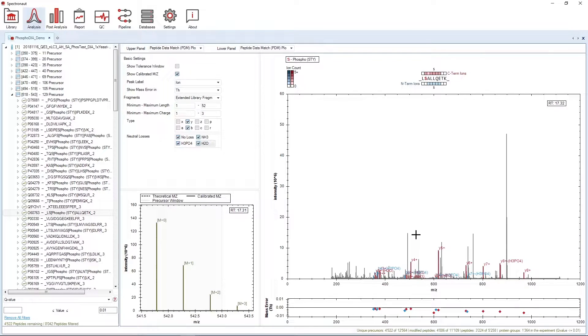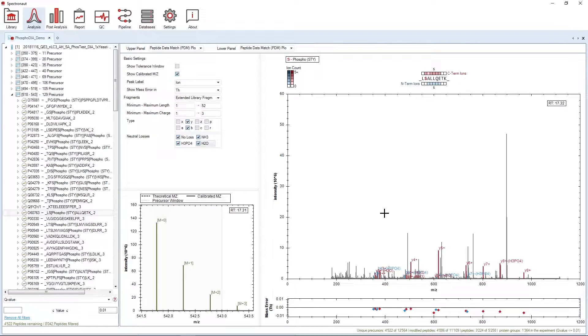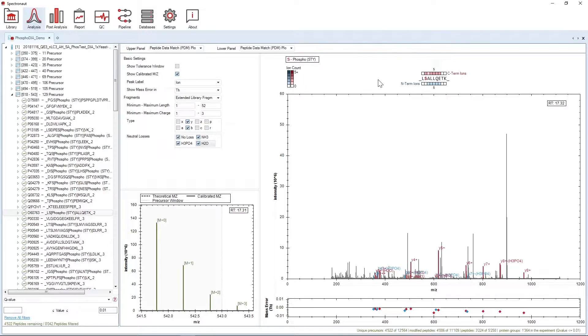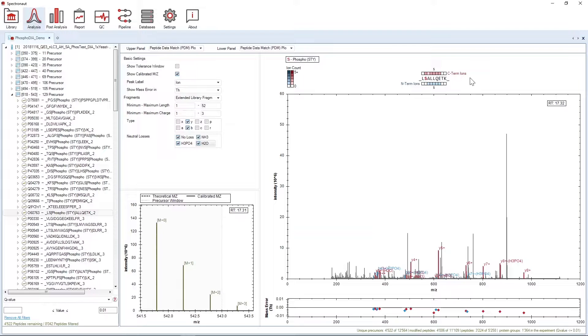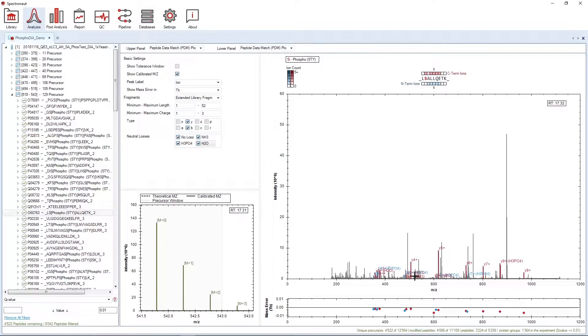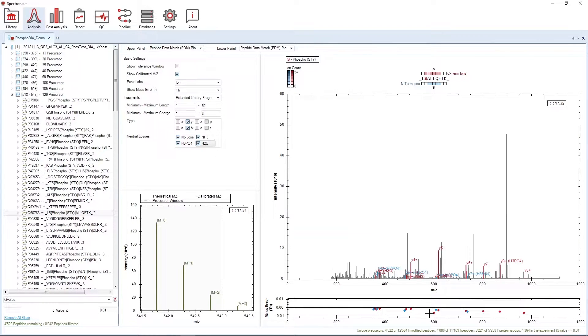The spectrum panel on the right shows an Apex MS2 scan with fragments as selected by the settings. The Sequence Coverage panel in the top right frame indicates how much evidence there is for a certain amino acid position based on the fragments, in two directions, both N-terminal as well as C-terminal. The lower right panel is the mass error panel and shows the mass error between the theoretical and measured MZ of a fragment.